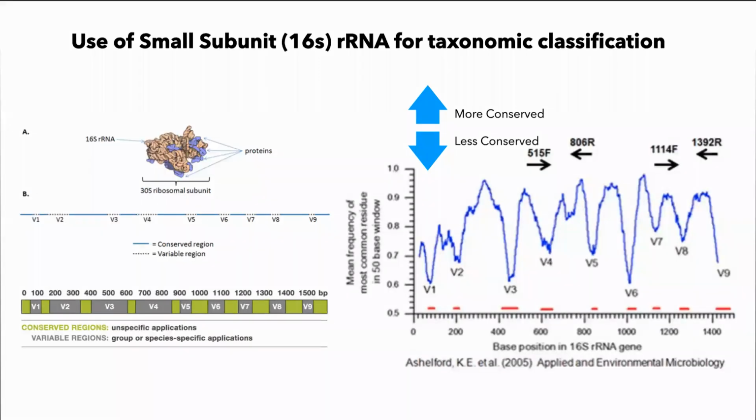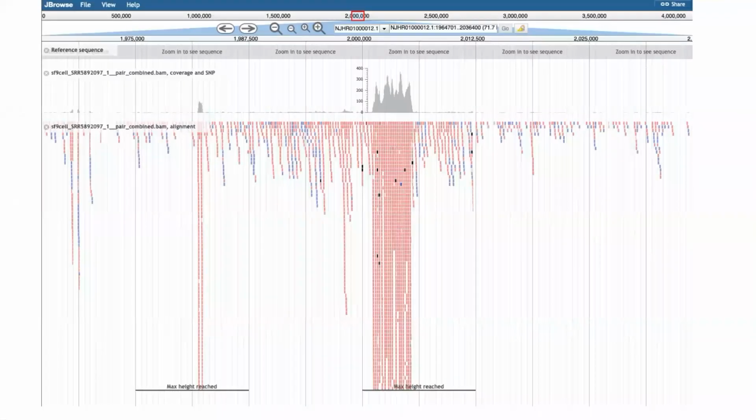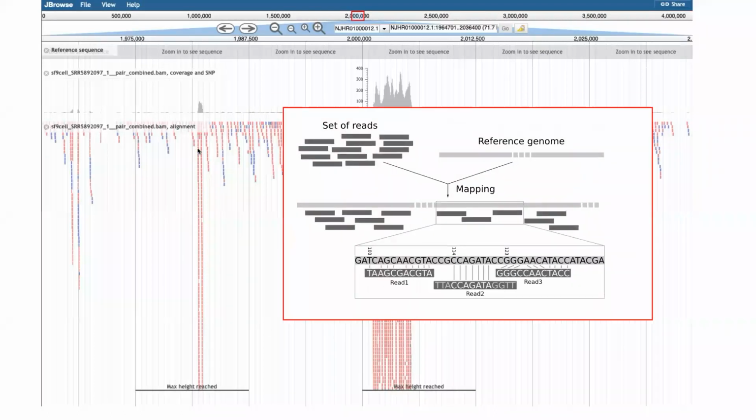So we looked at an example of alignment, and there was a question. The question was, how do we know how reads align to the reference genome? If I'm correct, that's how I understood the question. I don't exactly remember what the actual question was, but I believe it was to just reiterate and explain again how the reads fall onto the reference genome. So each one of these lines right here represents a read.